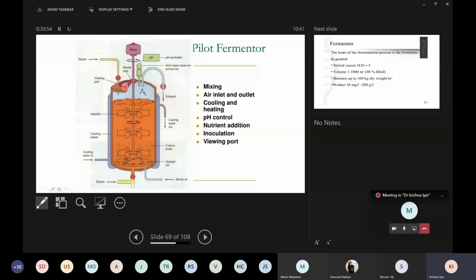Sometimes this is very important because people who do fermentations for a living can actually look at the fermenter and tell you whether things are going correctly or not. This is very important to make sure that things are under control inside the fermenter. If everything is closed and I can't even see inside, and I have to rely only on these measurements, they will tell me a few things. But sometimes, as I say, seeing is believing. A lot of big fermenters generally will have a little port so that you can always keep an eye on the fermentation.